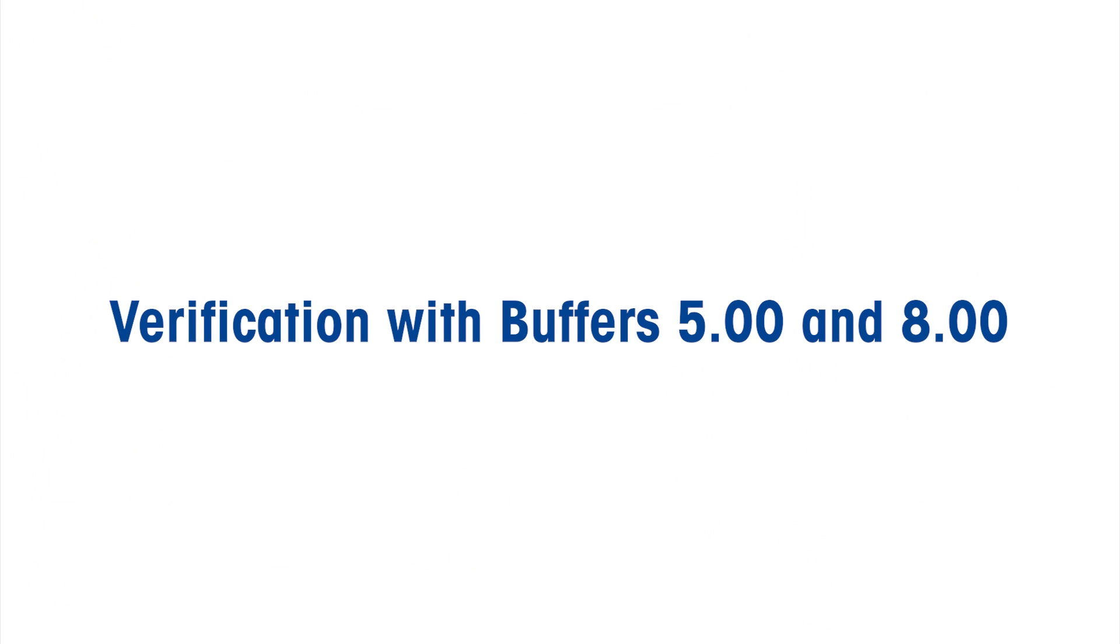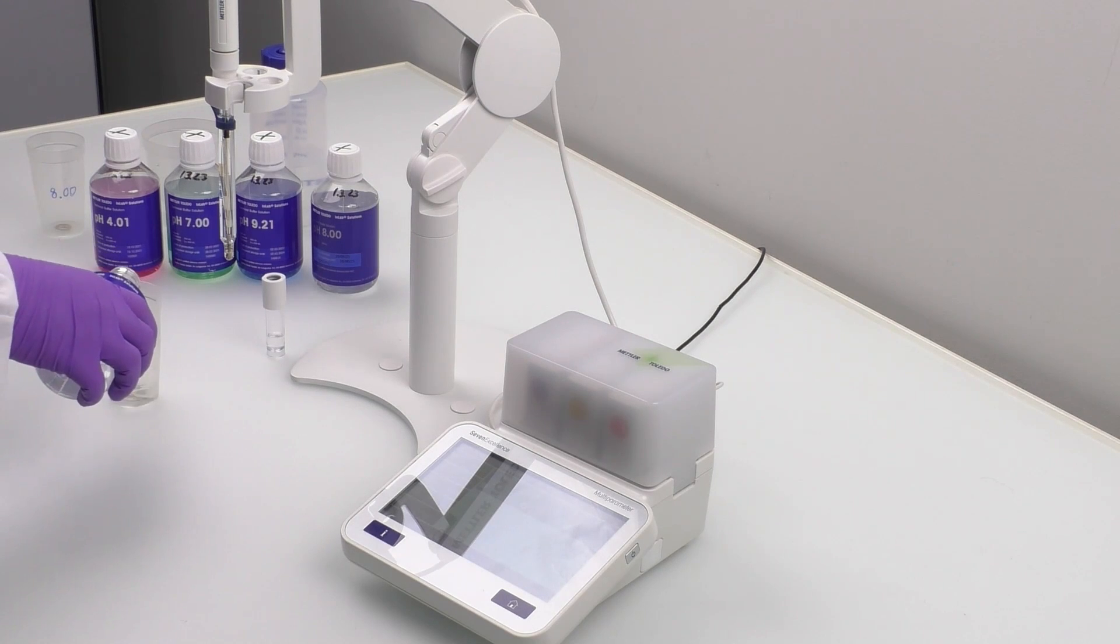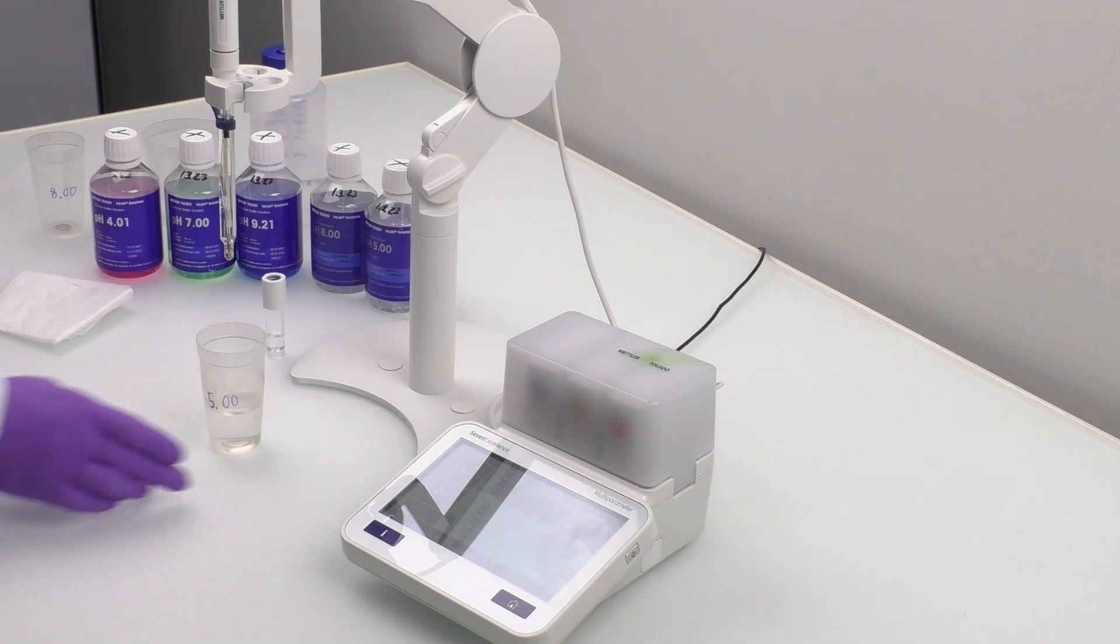After the calibration, the next step is to perform verification with pH buffers for each segment. In our case, we will be using pH buffers 5.00 and 8.00 since they're within the three calibration segments. To perform pH 5.00 verification, pour around 40 milliliters of the buffer into a pre-labeled beaker and immerse the sensor completely in the solution.